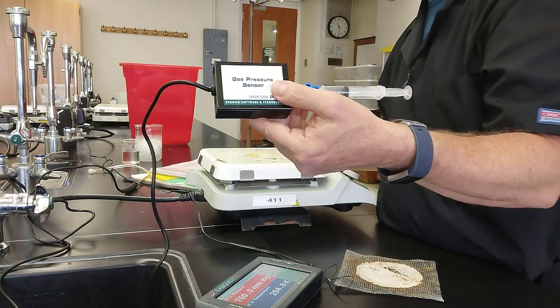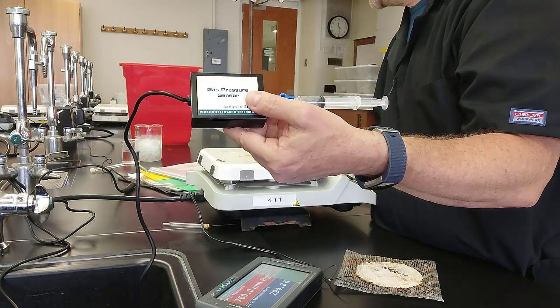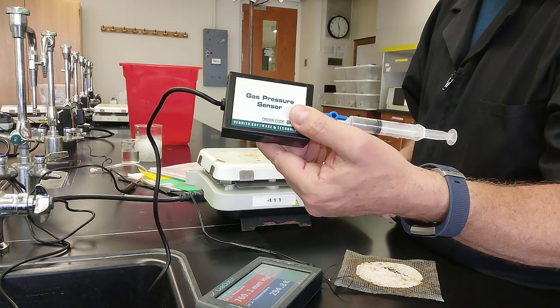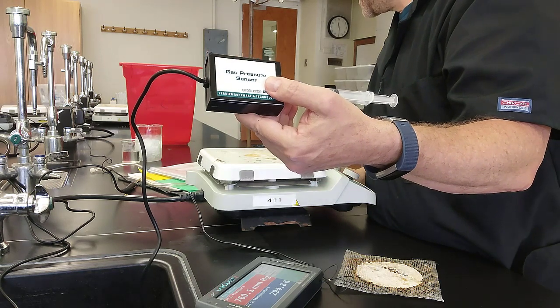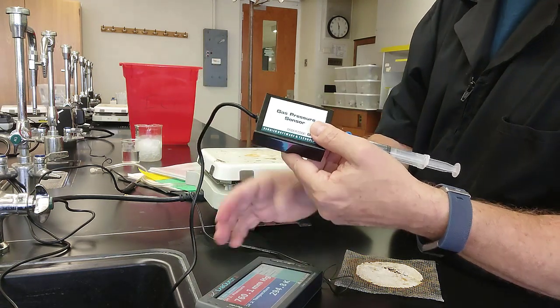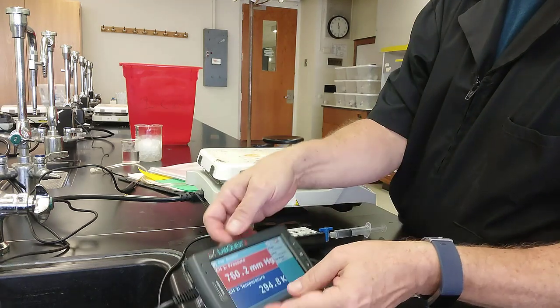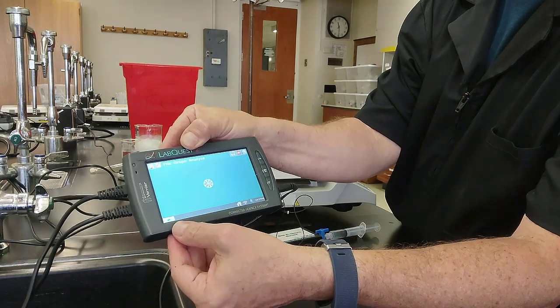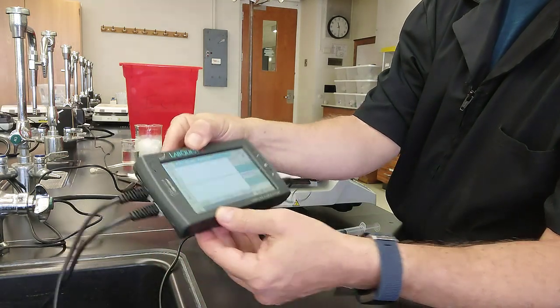And then it says, set program up to read and plot pressure, which we already have set up, and start the program to collect the data. So we just press the green button in the corner to start collecting data. Okay?